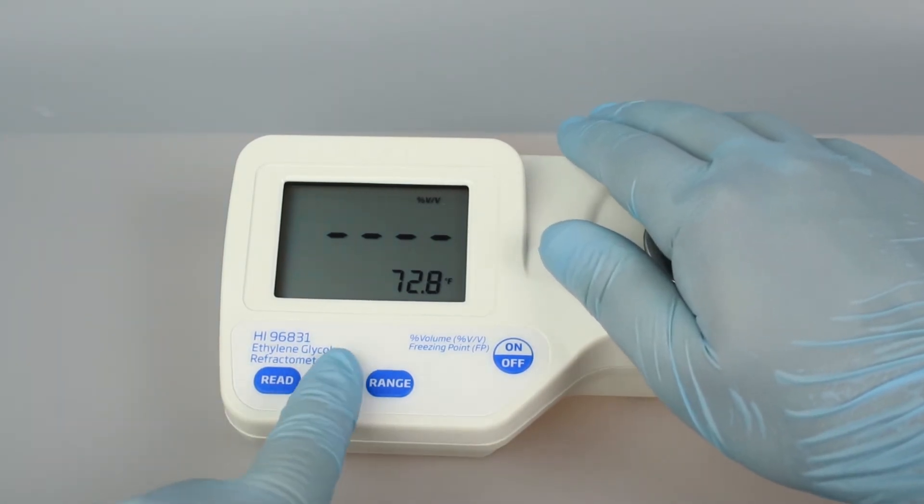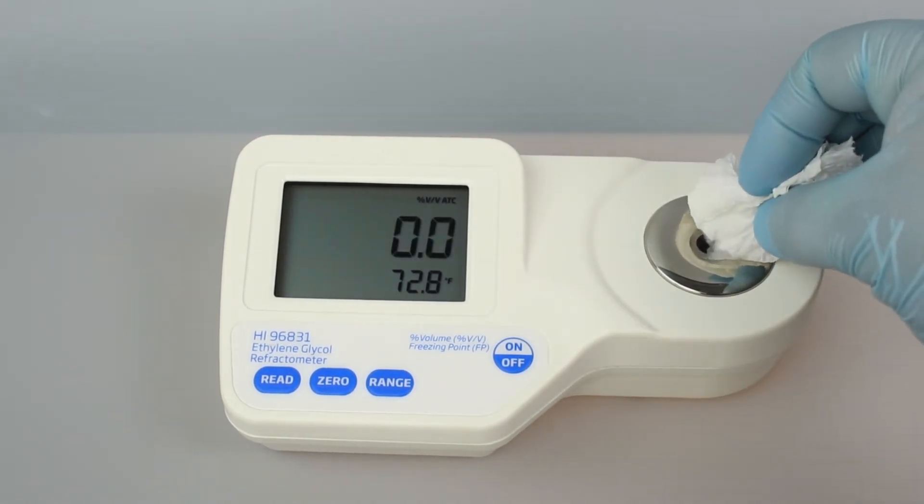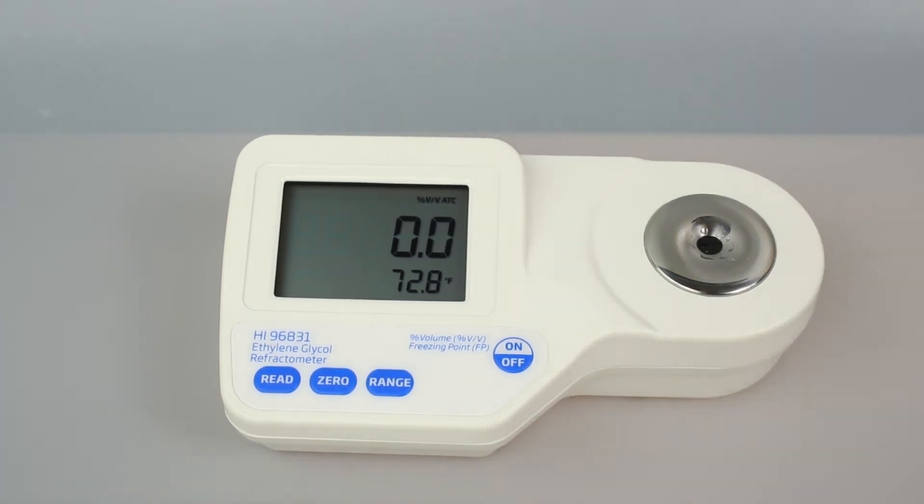Press the zero button. Once zero appears on the screen, use a soft tissue to absorb the deionized water off the prism. After calibration, the refractometer is ready for measurements.